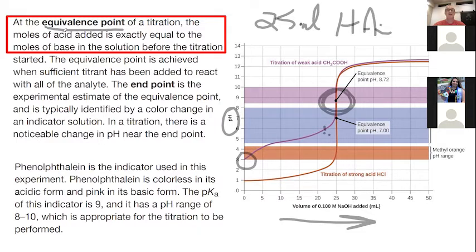Notice that the equivalence point isn't at pH 7. And that's because our conjugate base is acetate ion. And as I mentioned, acetate ion is a relatively strong base. And so it increases the pH. So if you had a strong acid and a strong base, the equivalence would be at exactly pH 7 because the conjugate acid and base there are both weak. In this case, we have a strong conjugate base, so the pH is a little bit higher.